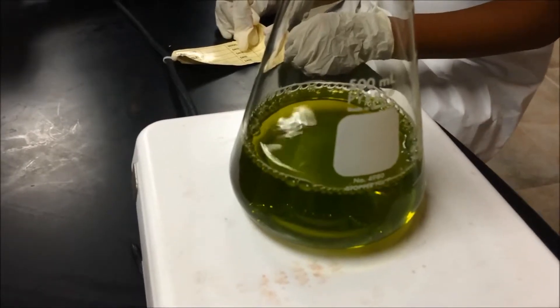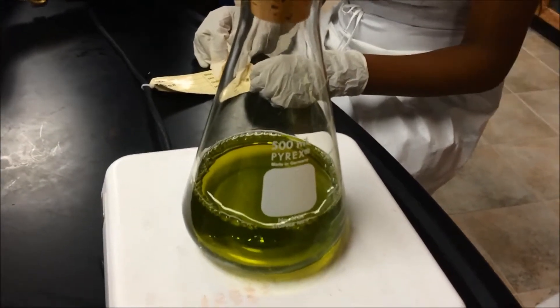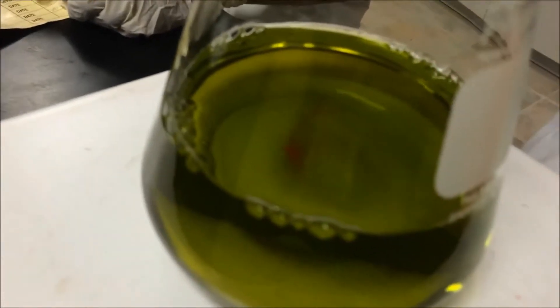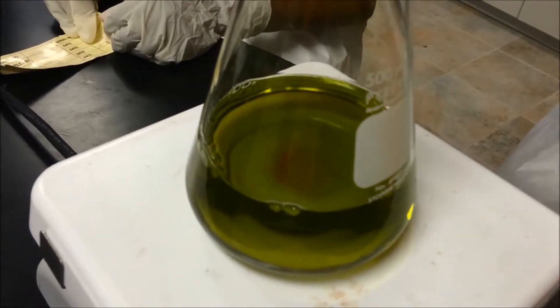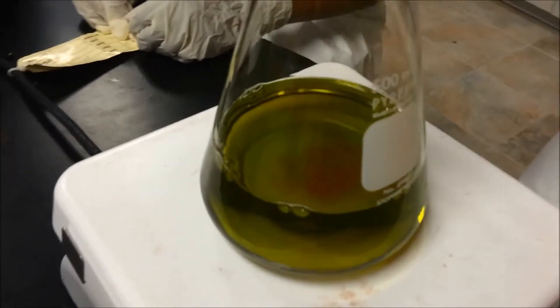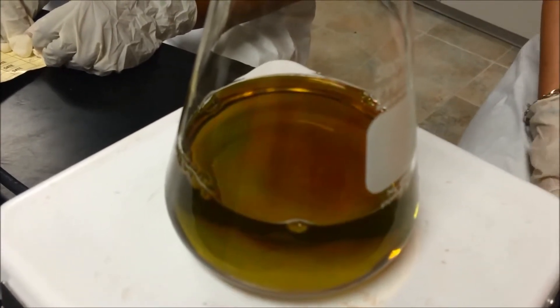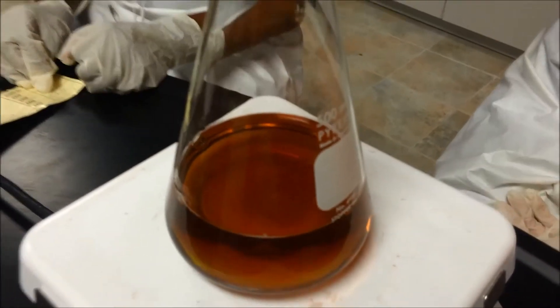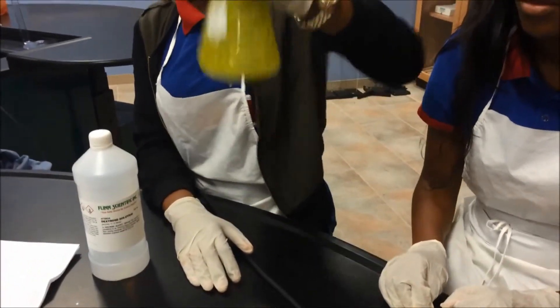Dextrose is a reducing sugar. It reduces the indigo carmine indicator to the yellow form in the presence of base. When the yellow solution containing the reduced form of indigo carmine is shaken, oxygen from the air above the liquid dissolves in the solution and re-oxidizes the indigo carmine. The overall oxidation occurs in two steps: first to the intermediate red form and then to the fully oxidized green form. This two-step oxidation sequence can be controlled by the rate of shaking, which influences the amount of oxygen that dissolves in the solution. When the solution is no longer being shaken, dextrose molecules again reduce the indigo carmine back to the yellow color.